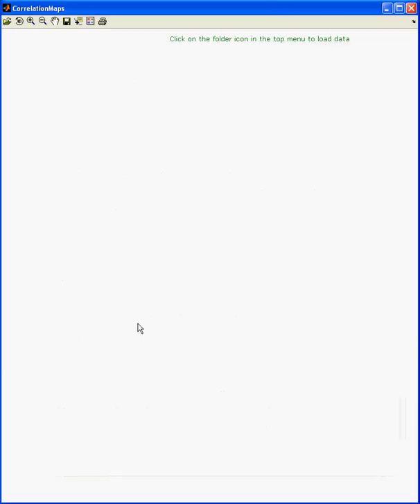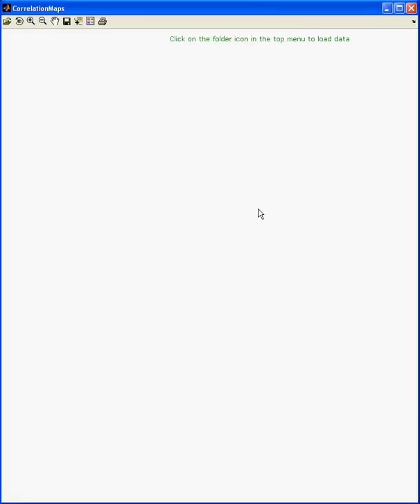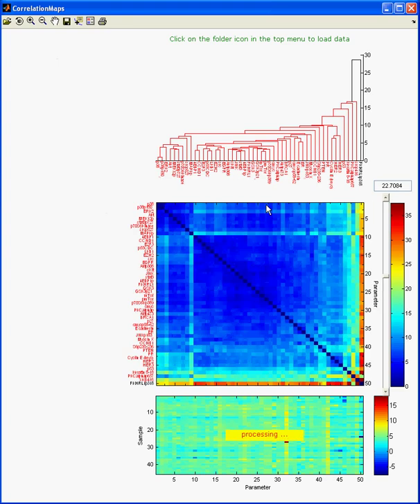The current version has no frills. It starts like this with nothing on it. You can get your data from text or Excel or even S3DB. So I'm going to load the data. I'll go back to the five points in the end.